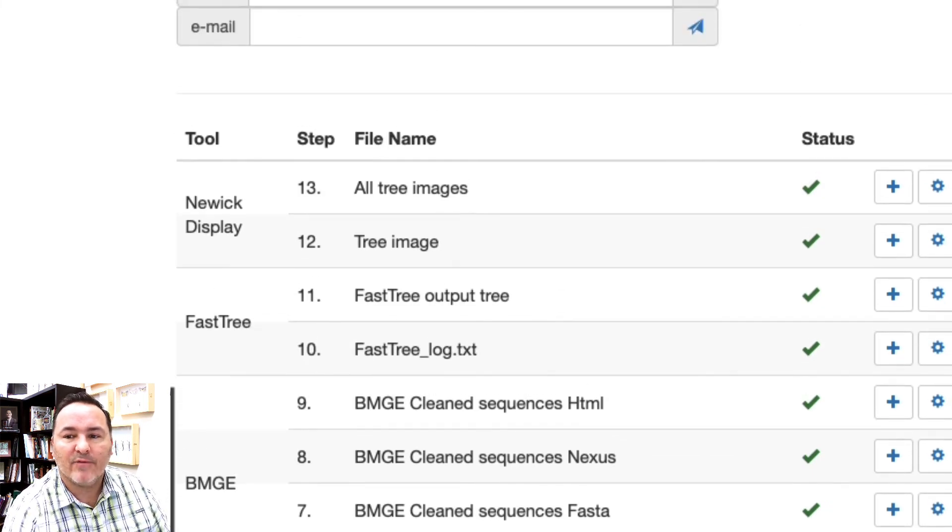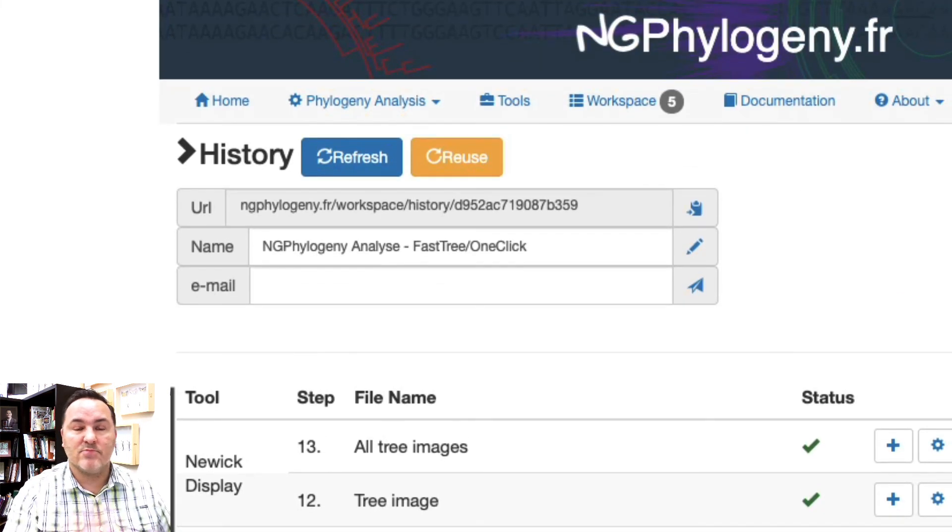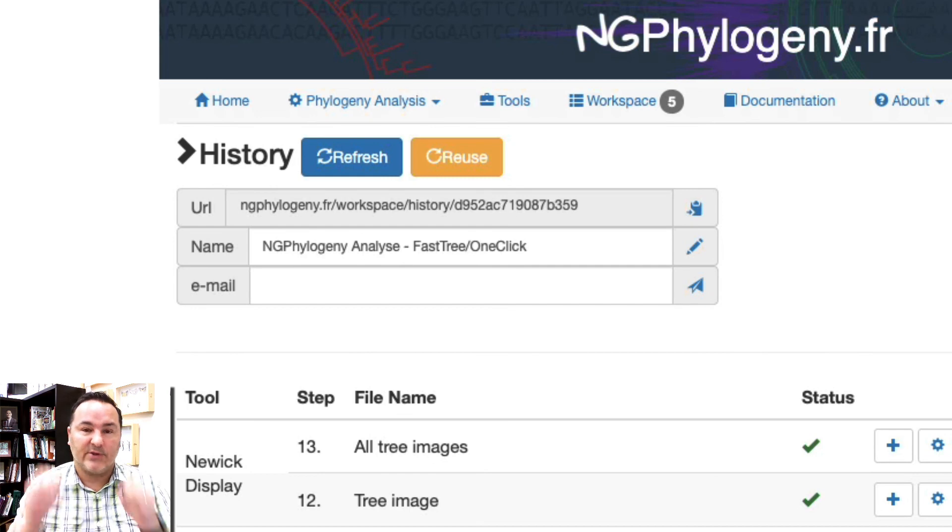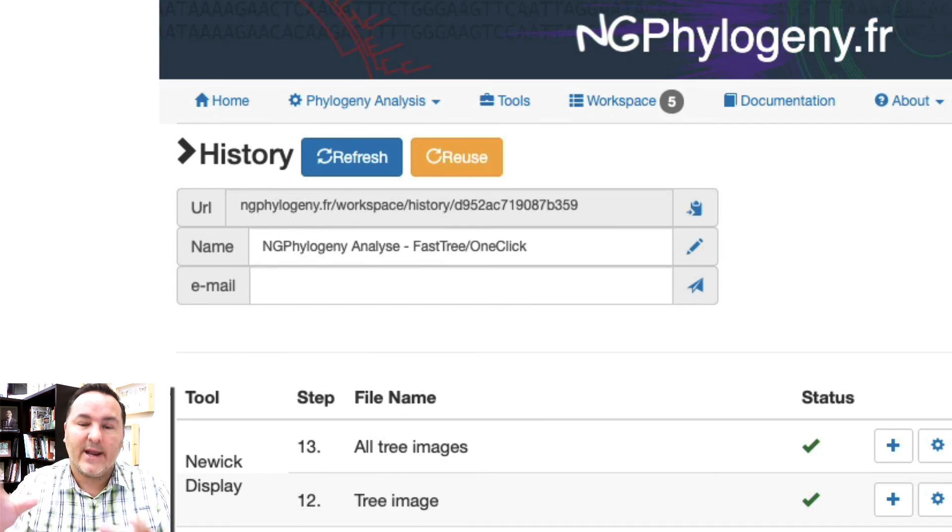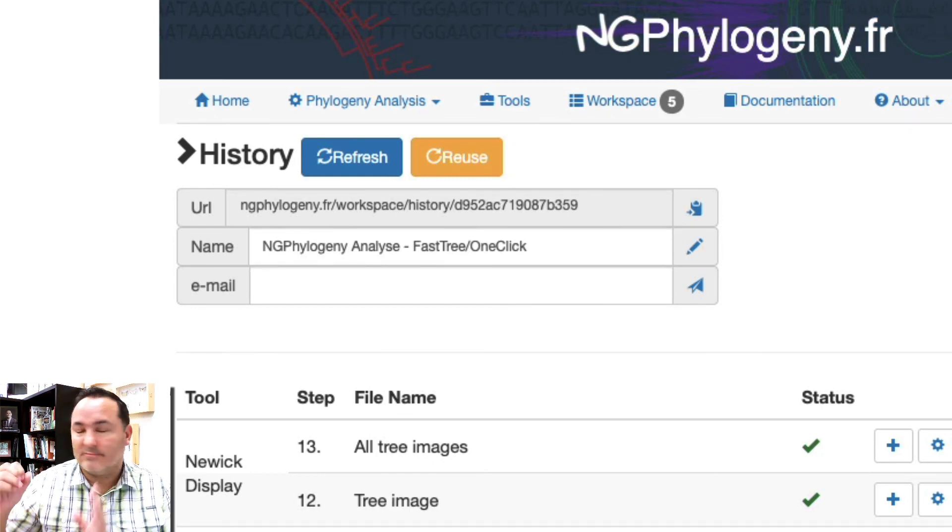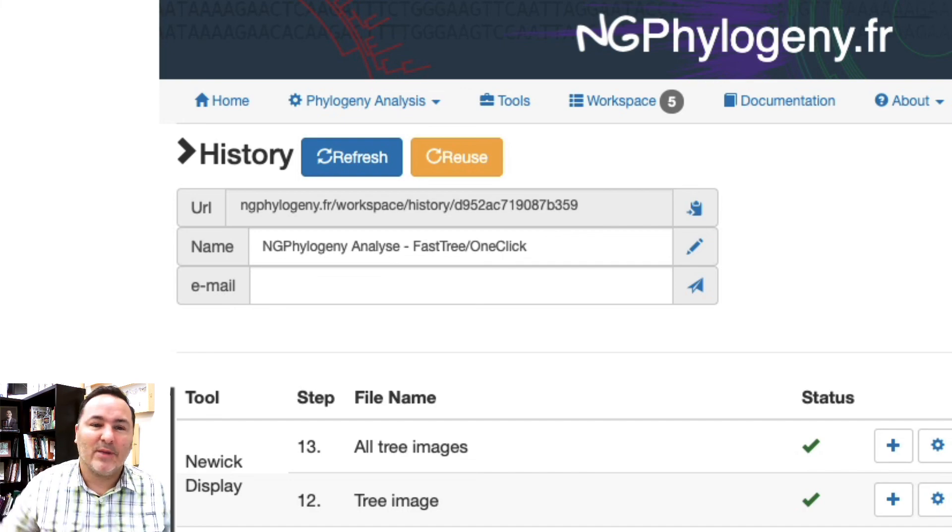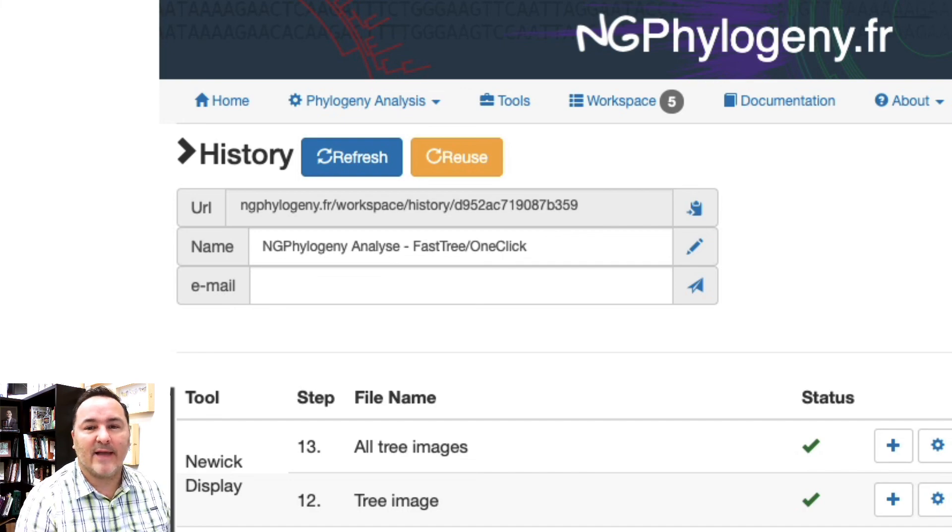So really powerful website. The nice thing too is that you could do multiple analyses. You could get one analysis running and then go start another browser, start another analysis, and you could do a bunch of different kinds of analyses.